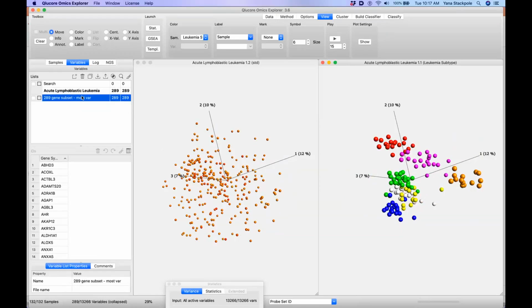What's this variance filtering doing? It's noise control, noise reduction. If your data set is noisy, and omics data sets are noisy, some more, some less, especially proteomics, metabolomics, this step will be crucial. Single cell will have a lot more noise as well. So removing low variance will show you clustering, of course, in this example, and also it will potentially increase statistical power, statistical resolution power.